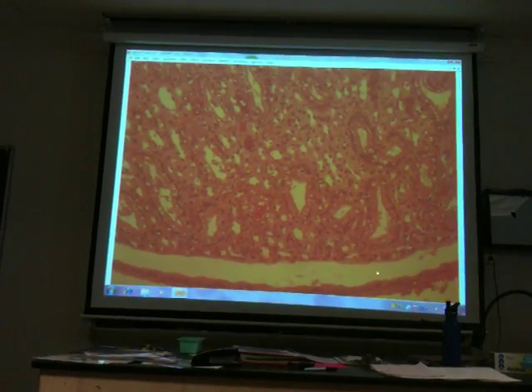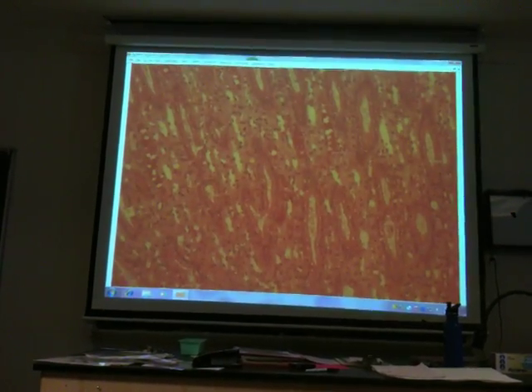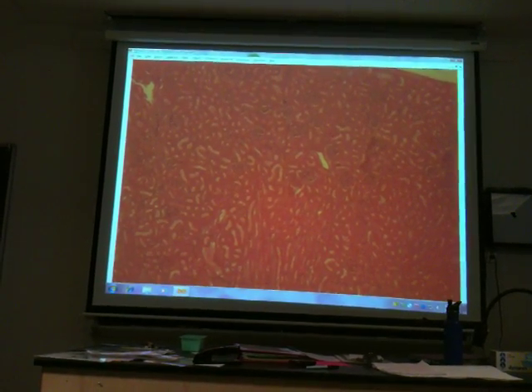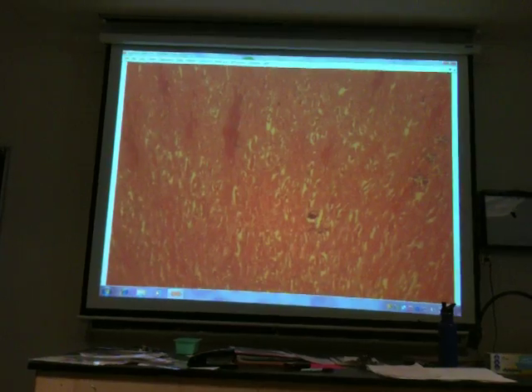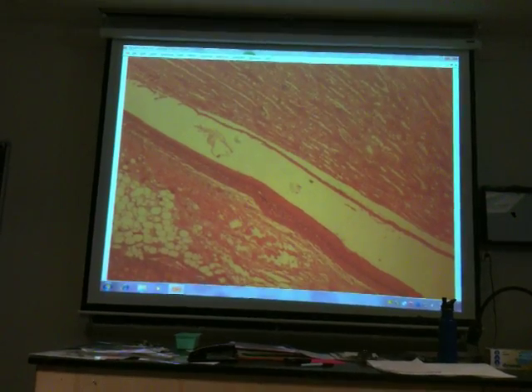And there is a renal papilla. Okay? So the layer name here is renal medulla. The structure name is convoluted tubule and or collecting duct. And take a look at that. And we'll fast forward to that. Quite a different appearance. You can find a place where you have not just longitudinal sections, but a lot of cross sections as well in the renal medulla. So that's the kidney. We have a section of the kidney that you can also study.